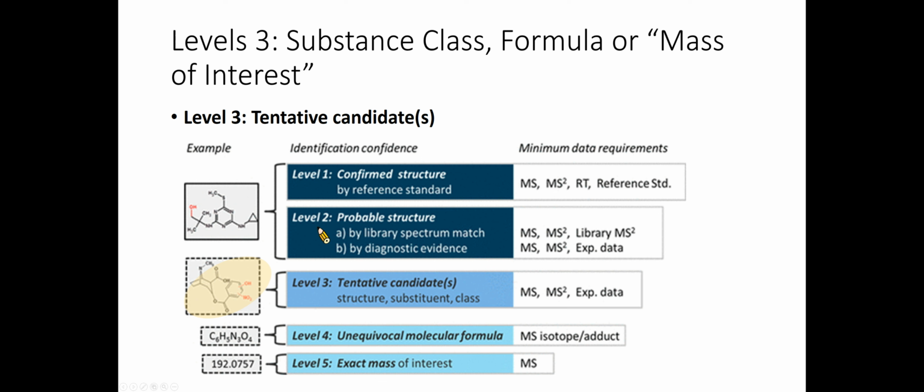An example includes where the position of the hydroxylation was not unequivocal, as shown in the yellow shade. Further examples are top-ranked structures from in silico fragmentation of candidates from compound database searches, and suspects selected using additional information such as high predicted likeliness of being a transformation product, the number of references, or retention behavior.